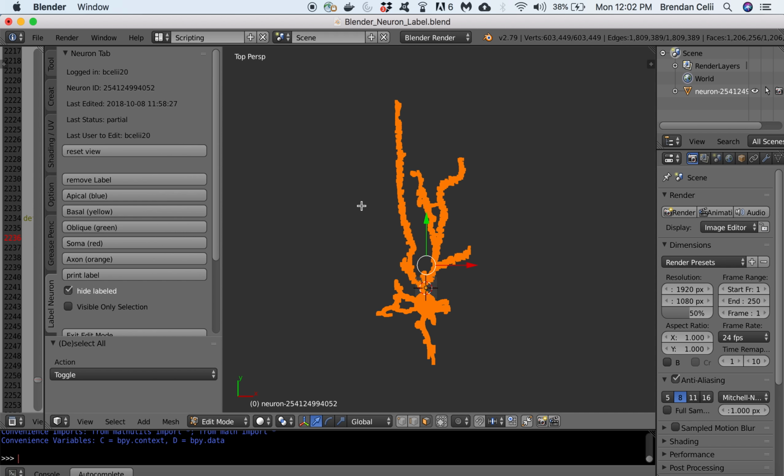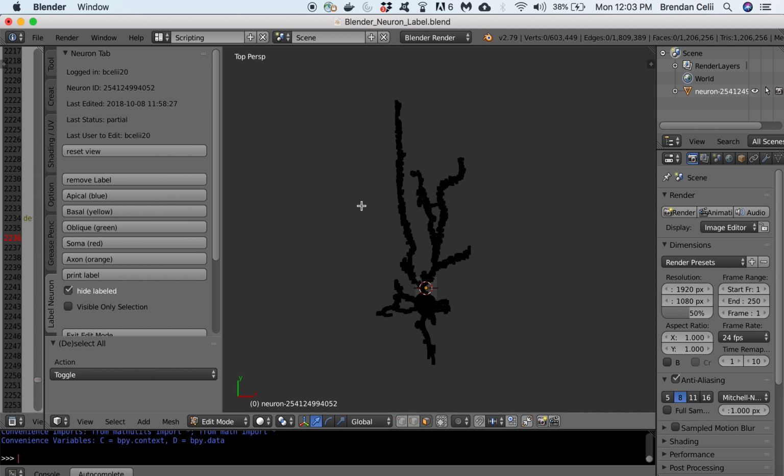A again will deselect everything. The two I'm going to teach you are, if you really wanted to select face by face, you just hit the right mouse button, or for laptop users, a two-finger click, and that will select a specific face.